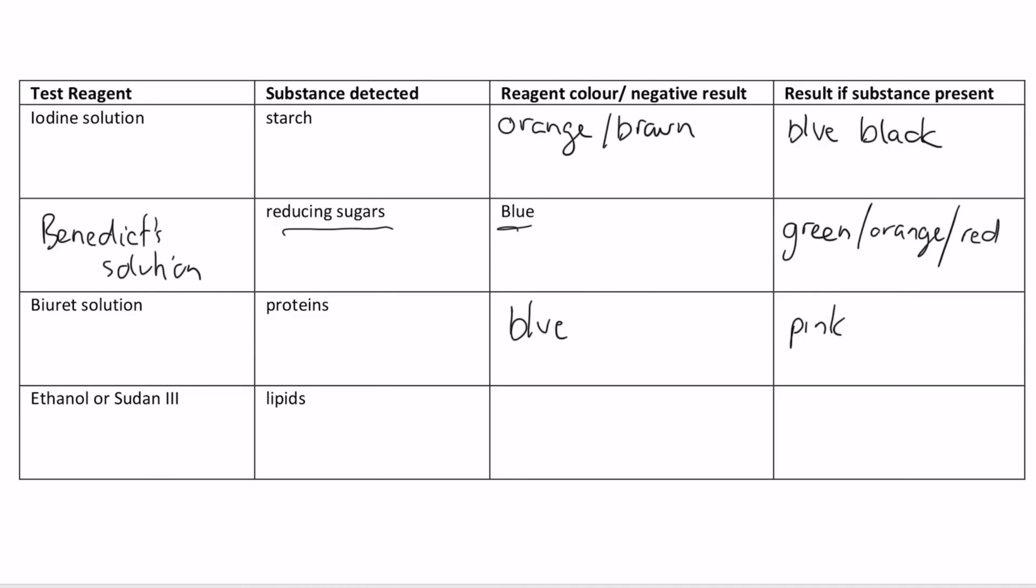Next one we've got: Biuret solution over here. It's a test for proteins. The reagent is blue and it will go a pink or purple color depending on if the protein is present.